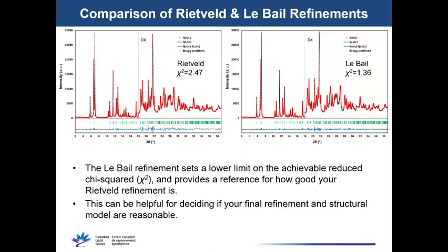Since the Lebail and Pawley methods don't require structures, they're actually very useful for comparing to the Rietveld method, because they give you an estimate of the best fit you can obtain with the Rietveld refinement. Because there are no constraints on the intensities, you should always get a better fit with your Lebail or Pawley refinement than you do with your Rietveld.